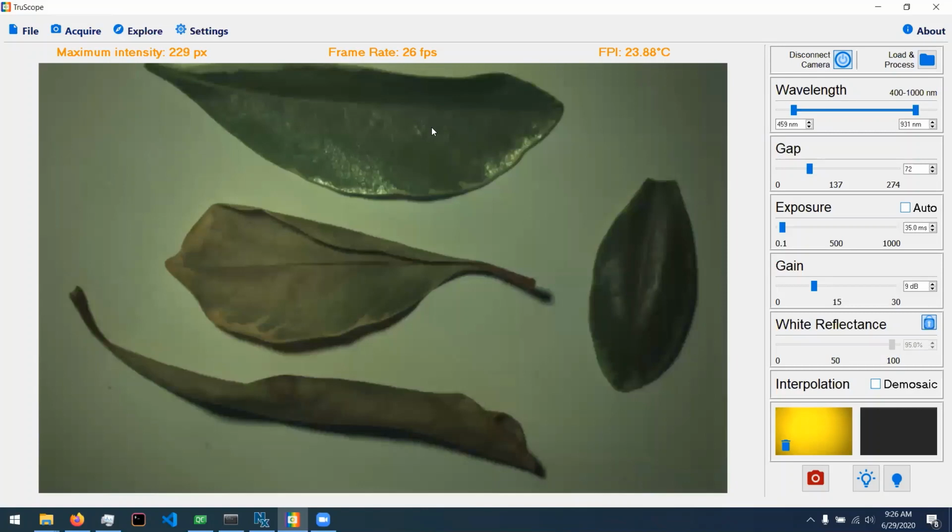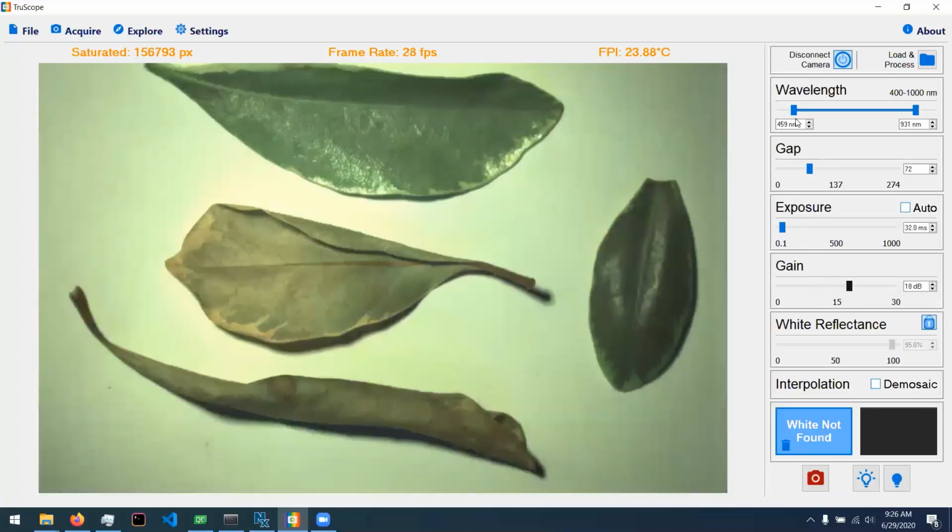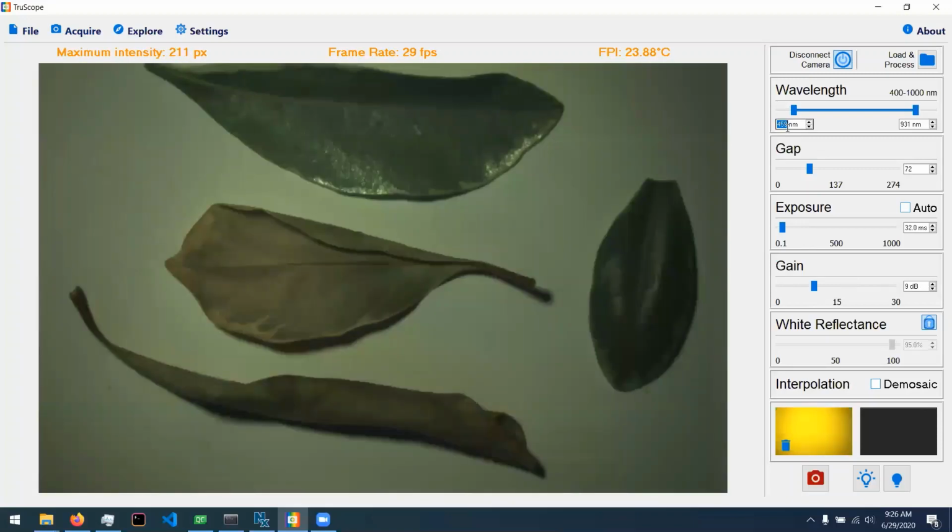On the right, adjustments can be made to set the exposure time and gain of the camera sensor and the wavelength range to be processed. A dark calibration data cube has been captured by the factory, but can also be captured by the user by pressing the dark bulb button. The dark calibration is performed at all gain settings, so it can take a little longer.